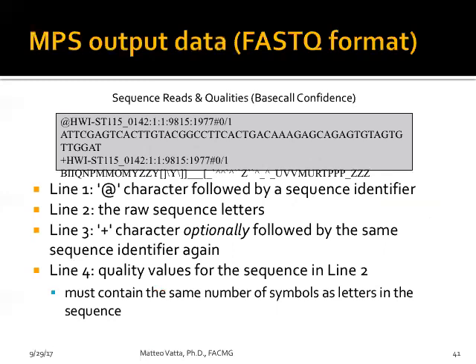So true, technology may change the way that you choose what type of test you want to do, but in reality it's not only the machine, it's everything that is implemented: the level of automation in terms of sample processing, sample handling, sequencing, and then the analysis.